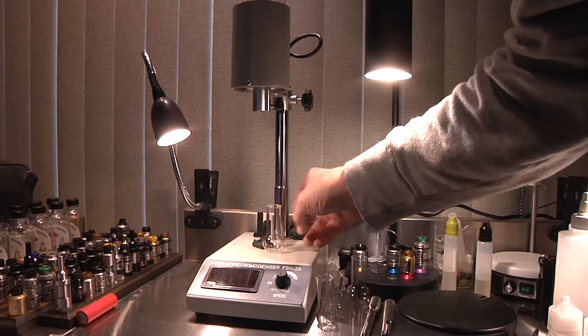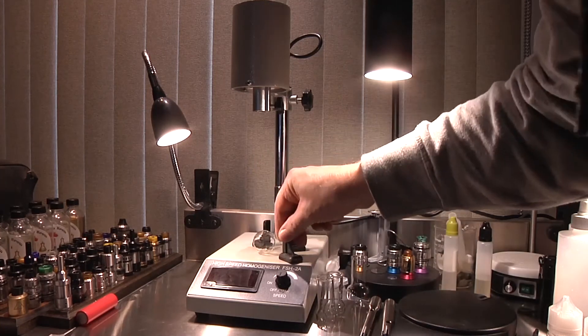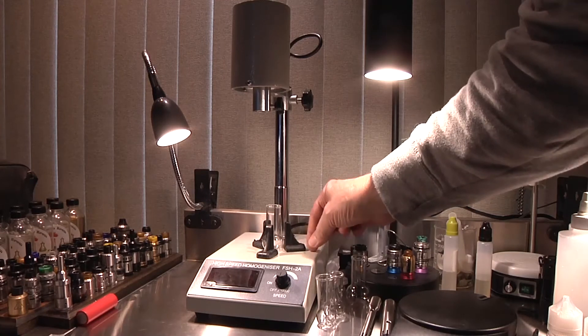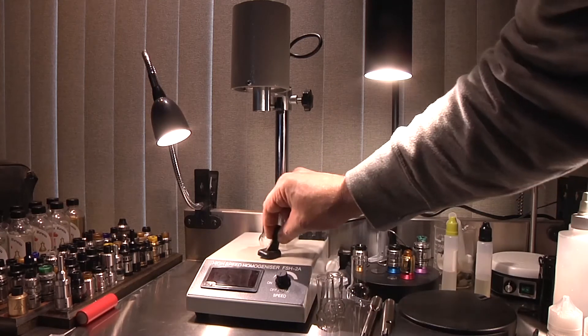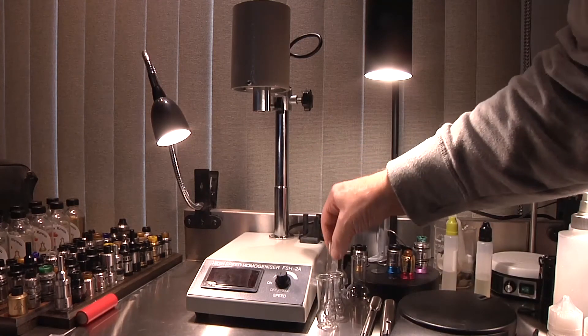You can put them around here to keep things in place — and knock everything over, of course. Those are magnetic and they stick to the bottom, so you can put them anywhere you want. I was a little worried when I first saw it in the picture — I thought if they really hard-mounted those to the platter that might be a problem, but nope, not at all.